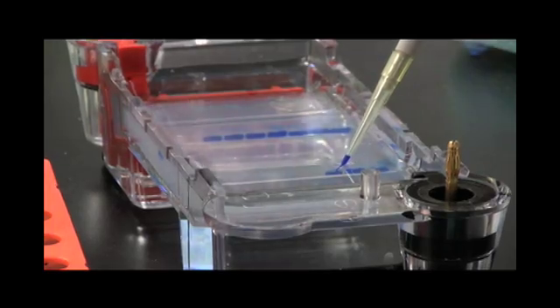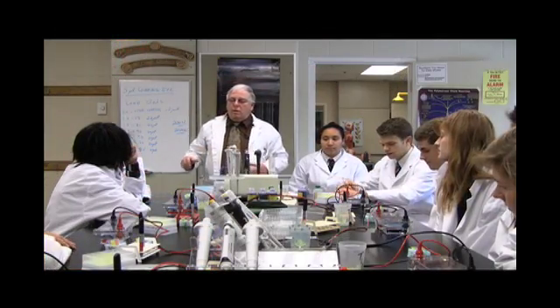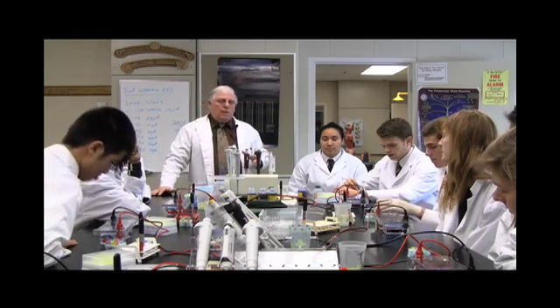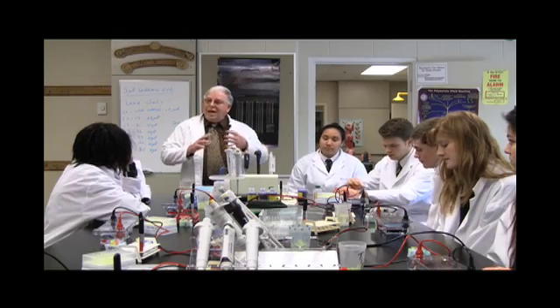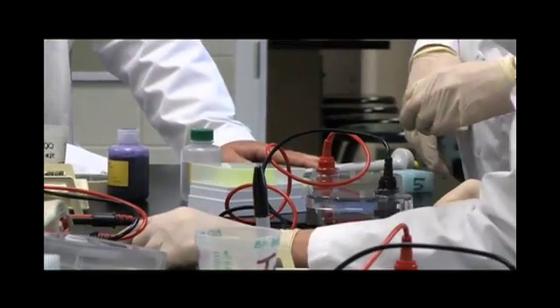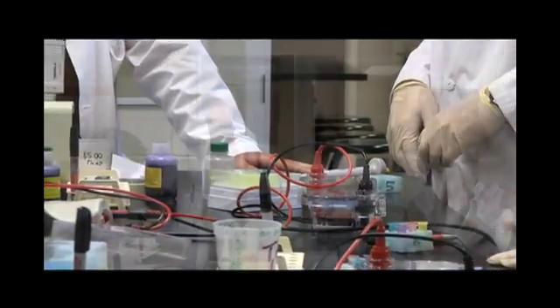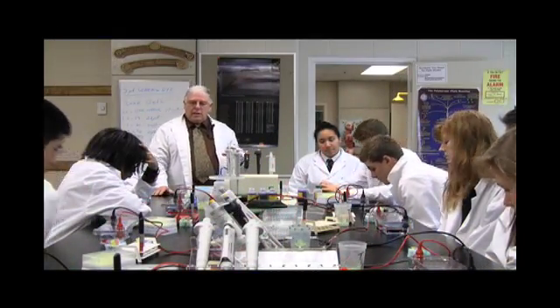What's happening right now is the buffer—a salt buffer—is becoming deionized or dissociated. There's a dissociation going on in the buffer with the electricity. You should now start to see your samples moving out of the well.